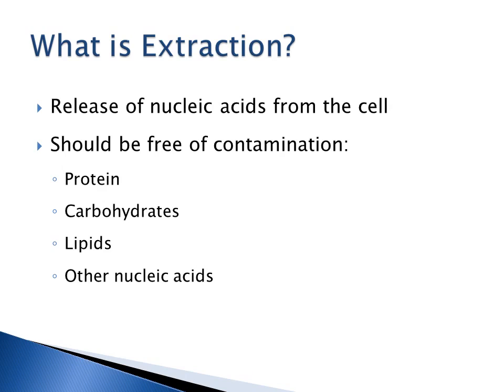So what is extraction? Extraction is when you release nucleic acids from a cell, and you're usually going to release these nucleic acids to use them for other methodologies. And you always want your nucleic acids to be free of contamination. So you just want that nucleic acid, whether it's DNA or RNA, to be nice and clean.